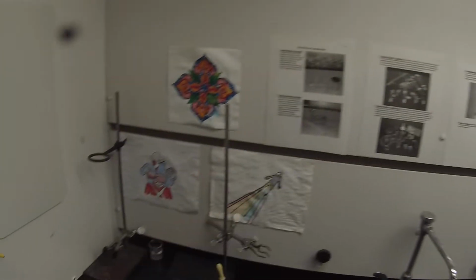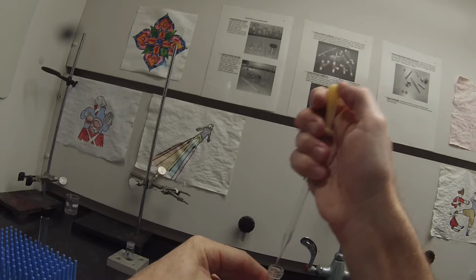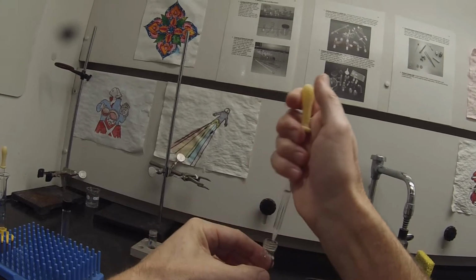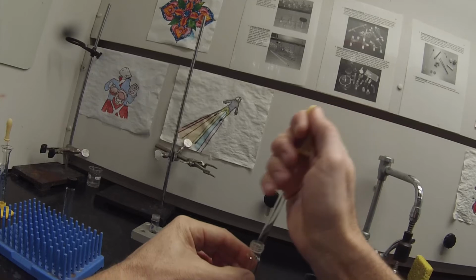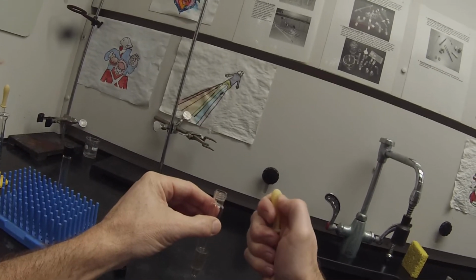Waiting for those layers to clear up. Looks pretty good. Top layer is still a little cloudy, but by the time I'm done transferring, it'll probably be fine again. Bottom layer out. And as before, if I accidentally take a little bit of the top layer with it, I can just leave it in the pipette.